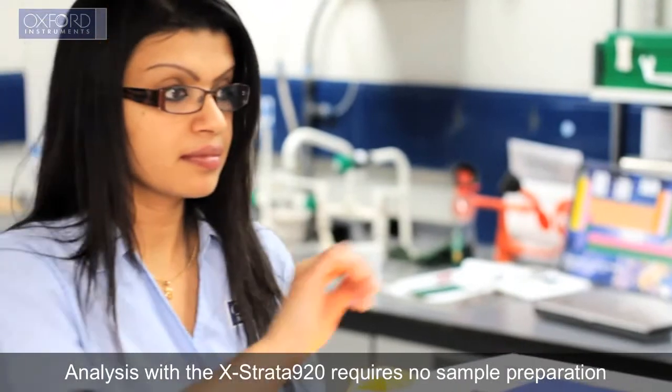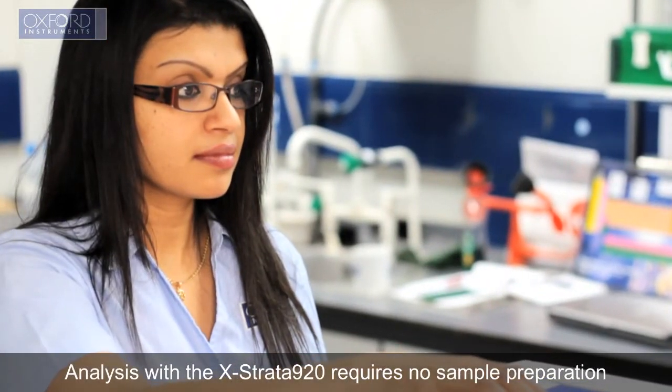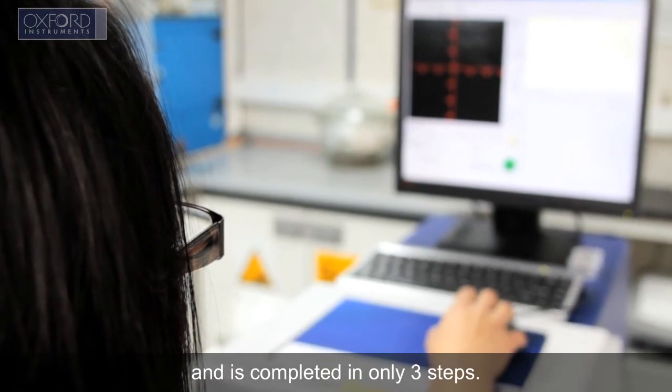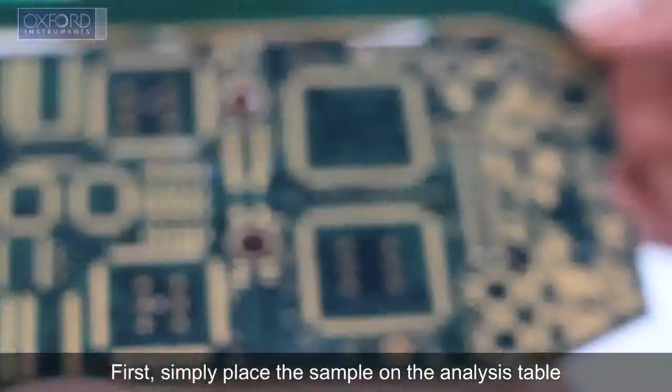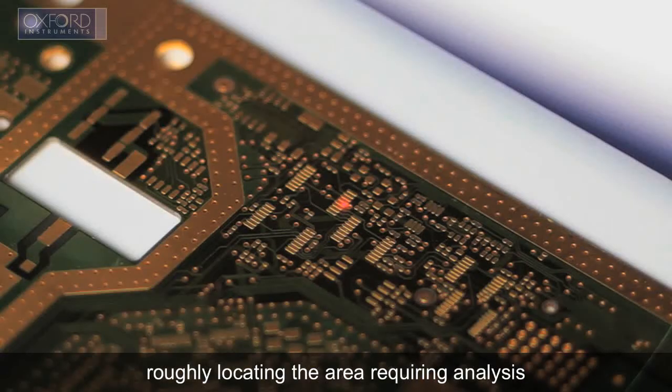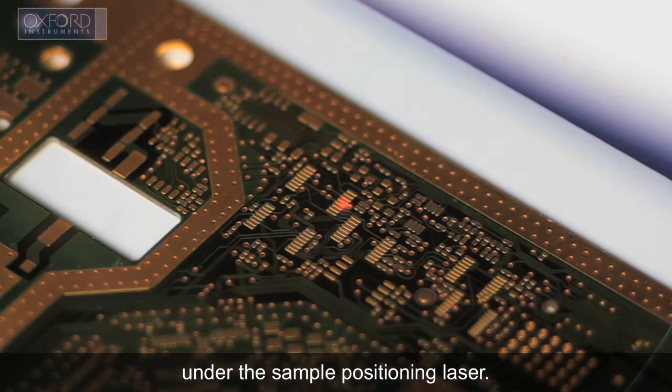Analysis with the Xstrata 920 requires no sample preparation and is completed in only three steps. First, simply place the sample on the analysis table, roughly locating the area requiring analysis under the sample positioning laser.